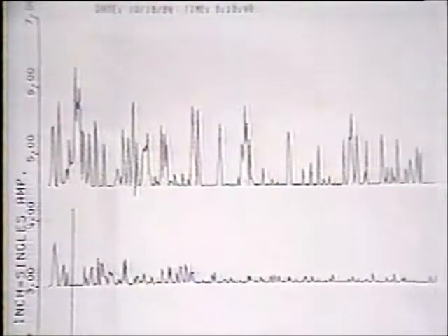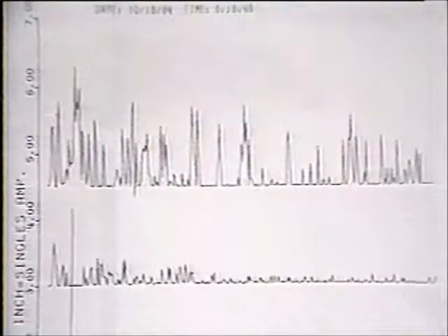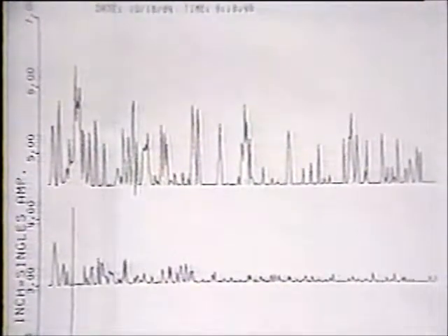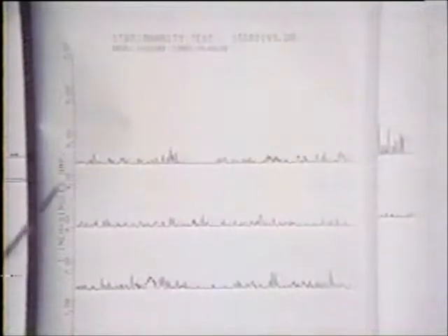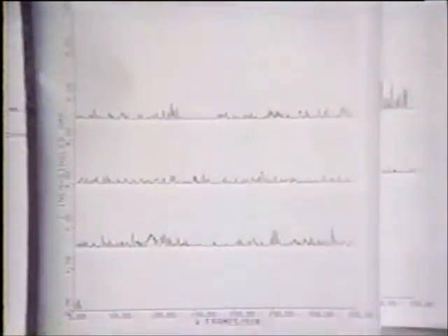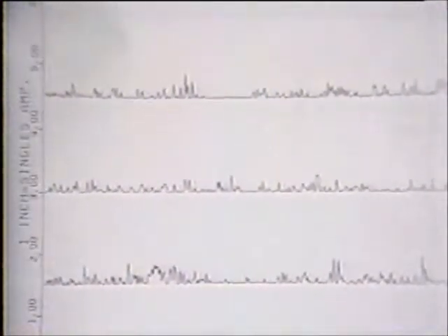The only time the histograms are valid is when you can show that your measure, whether it be on times, off times, probabilities, amplitudes, or whatever, is constant from the beginning of the record to the end of the record. In this record, this might be considered a reasonable measure of stationarity. This is a stretch-activated channel, and most forms of activity seem to come and go a number of times before the record is over. This we would regard as a fairly stationary piece of data.